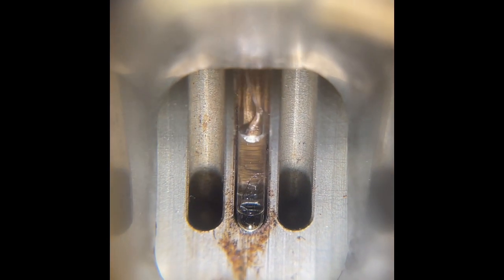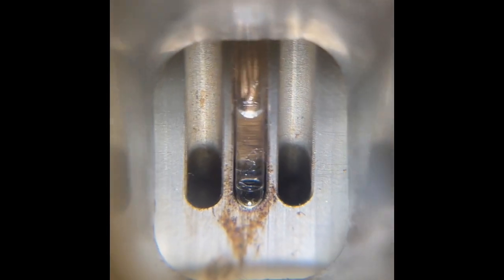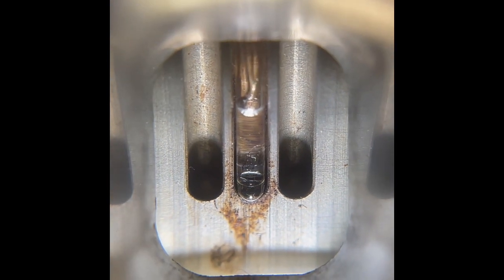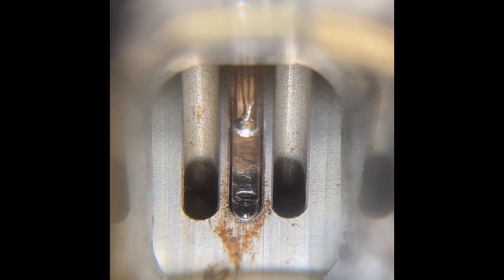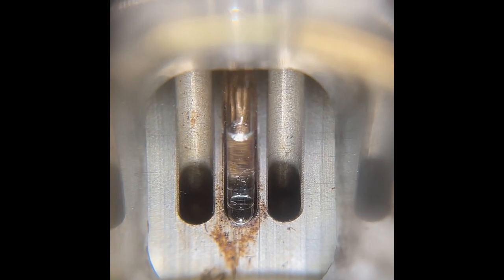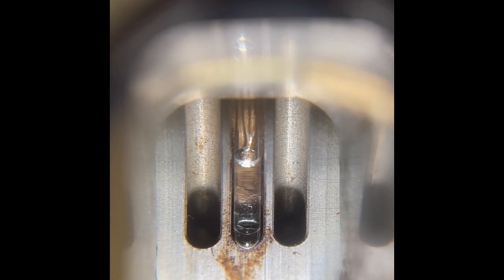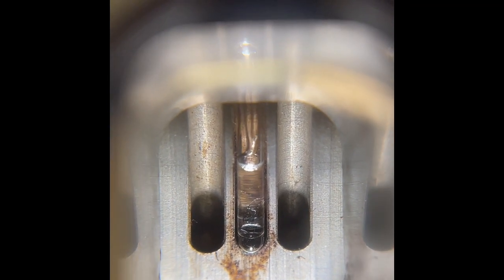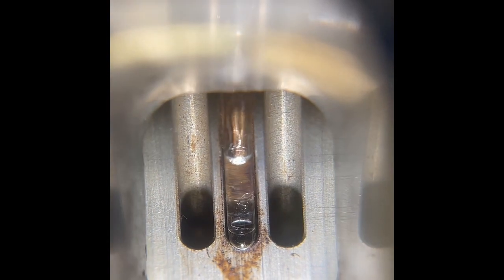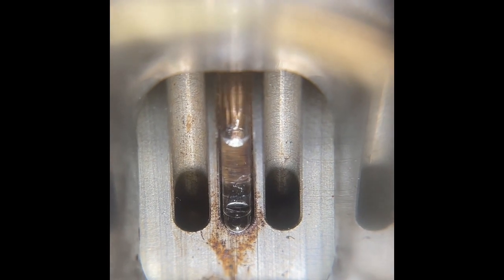So let's keep an eye on it. It is at 86.4, so I mean, what ifs? It's not pure, or it's not 95% ethanol, but that's cool. I wasn't expecting that. I did combine all of the fractions, remember? So this isn't the pure fraction or the best fraction that we had, the number one, where we had maybe 75 or something percent. But this kind of demonstration is more so you can see how to do a boiling point.